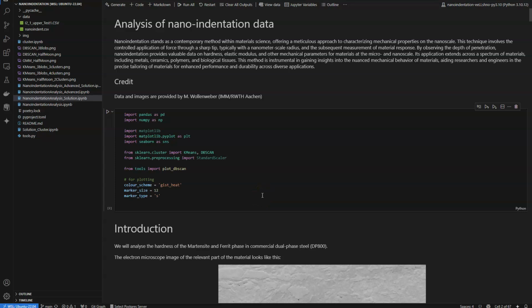Hello and welcome back. In this video I want to start discussing how we can analyze nanoindentation data with machine learning. Nanoindentation is a contemporary method in material science that we can use to characterize materials on the nanoscale. The technique involves using the controlled application of force through a sharp tip, typically on the nanometer scale radius, with subsequent measurements of the material response.